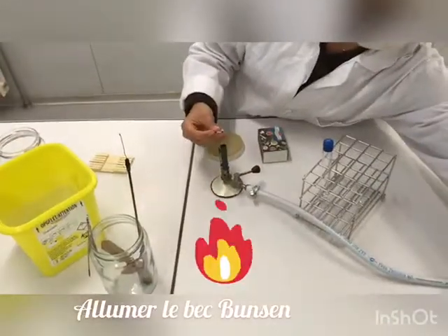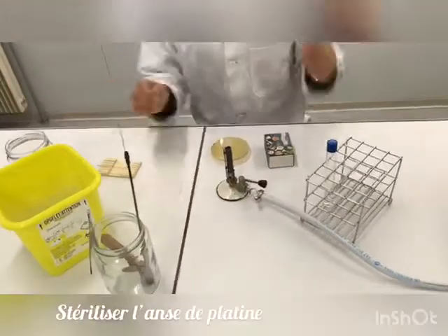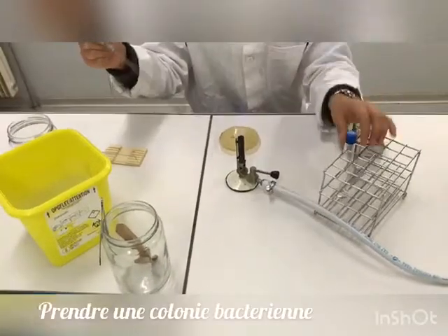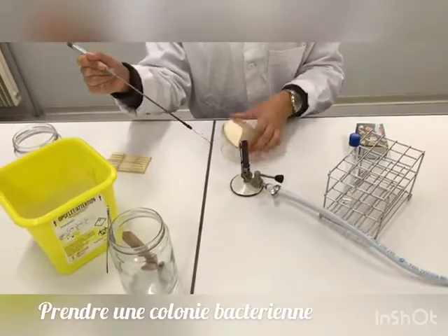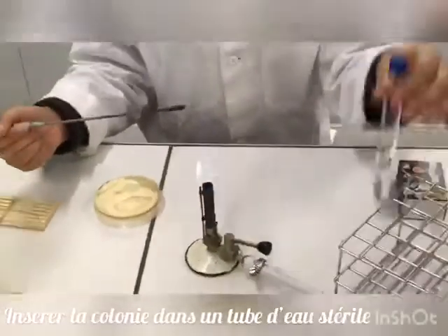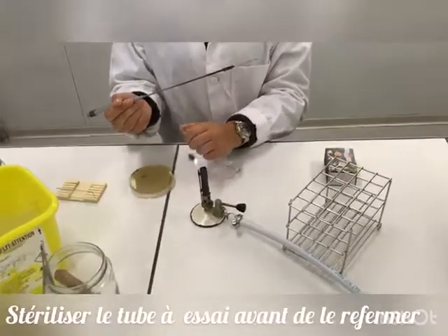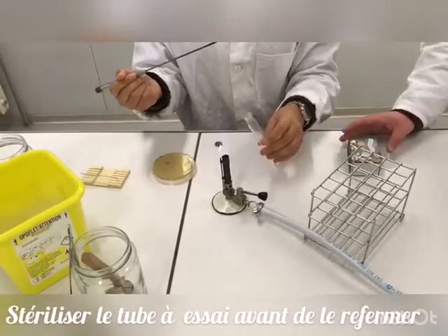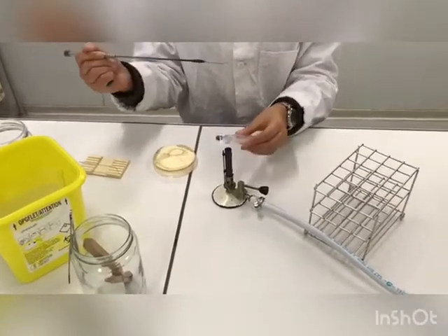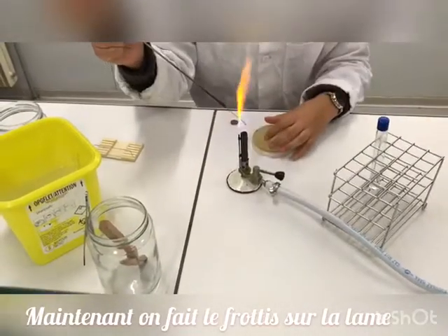We begin by turning on the Bunsen burner, then we sterilize the loop wire. Using the wire, we take a small part of the bacterial colony and put it into sterilized water. The test tube is sterilized before closing, and the loop wire is decontaminated prior to storage.